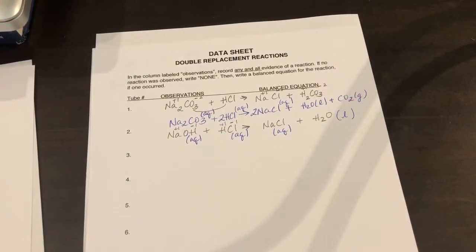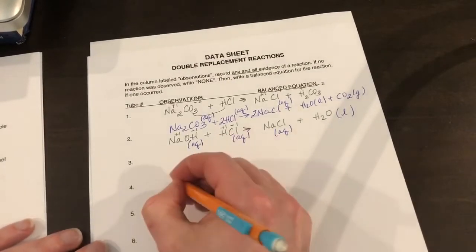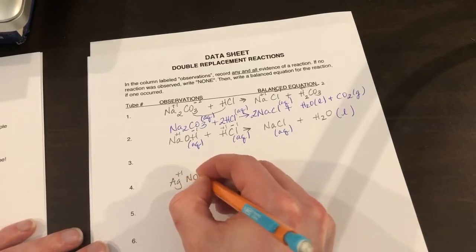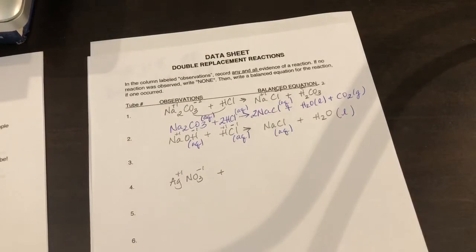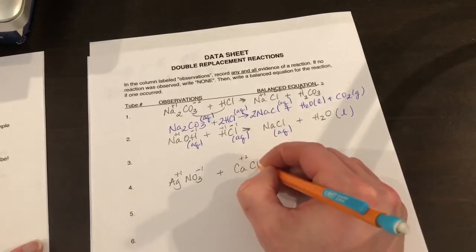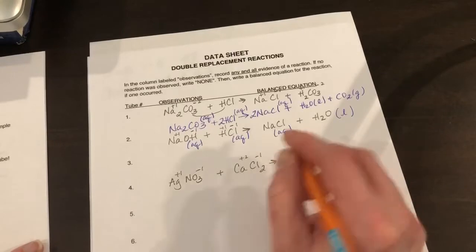Okay, let's do number 4. It says we're going to mix silver nitrate. Okay, so silver is Ag with a +1 charge. Nitrate's NO3 with a -1 charge. Plus, we're going to calcium chloride. So calcium is Ca +2. Chloride is Cl -1. And we're going to crisscross.